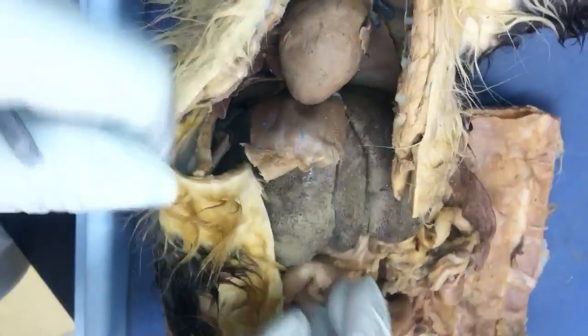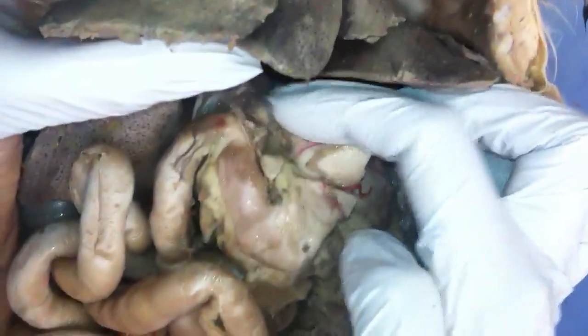This is the diaphragm. And then the lobes of the liver, there's left lateral, left medial, right lateral, and caudate, that's the fifth lobe.